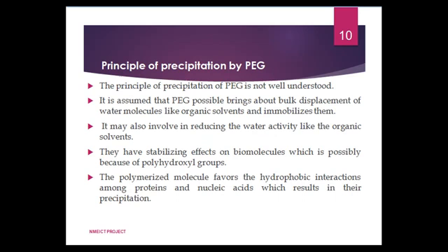It is assumed that PEG possibly brings about bulk displacement of water molecules like organic solvents and immobilizes them. It may also be involved in reducing the water activity like the organic solvents do.